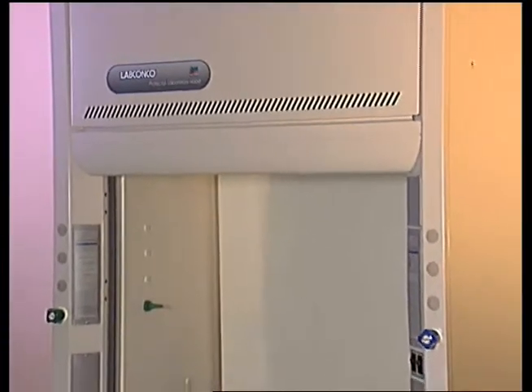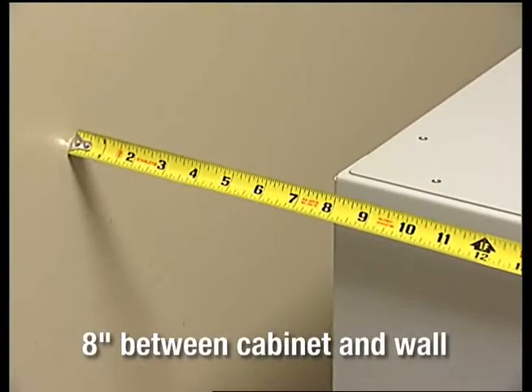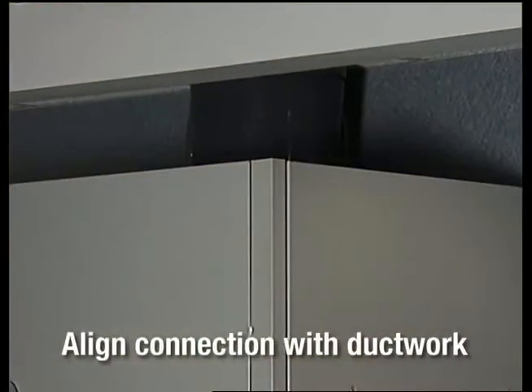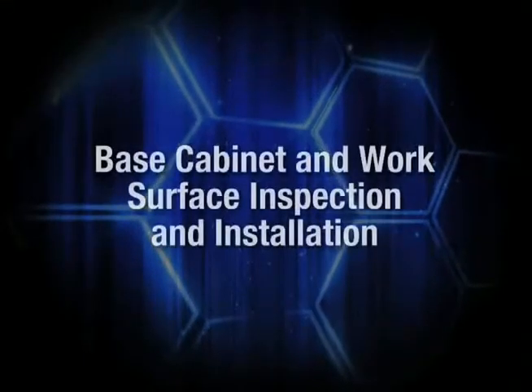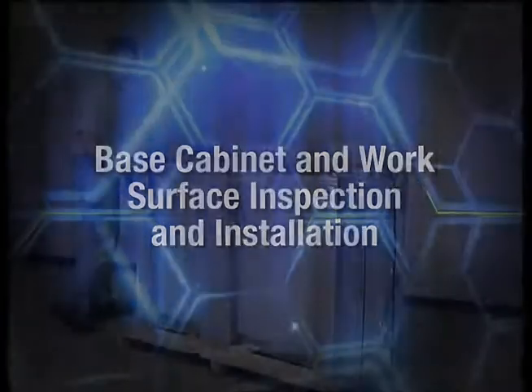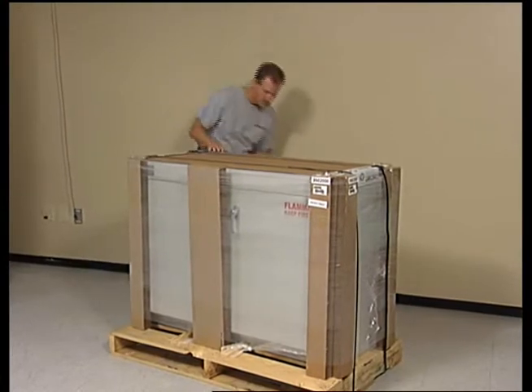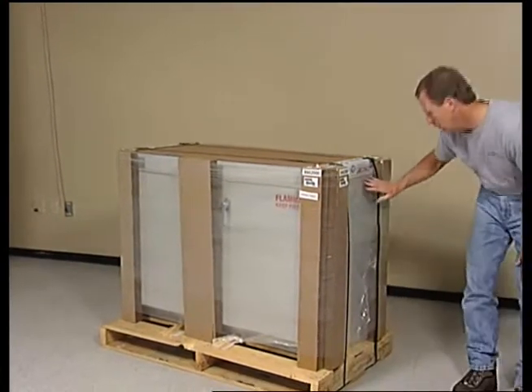Before placing the cabinet and fume hood in their permanent locations, ensure that at least 8 inches of clearance exists between the base cabinet and wall, and that the hood's exhaust connection will align with the ductwork. Carefully inspect the carton and its contents for any damage that might have occurred in transit. Do not discard the carton or packaging materials until all components are checked. Report any damage directly to the freight carrier.